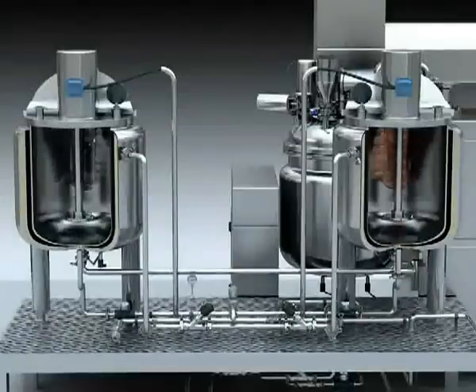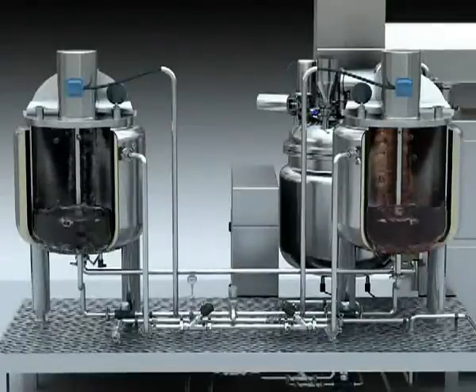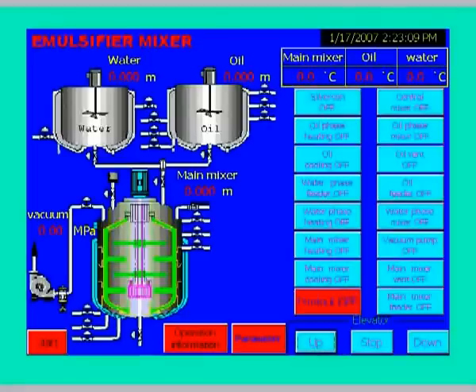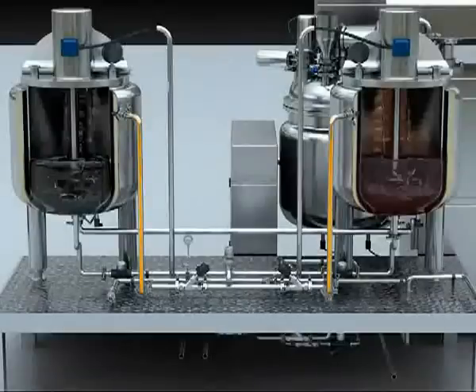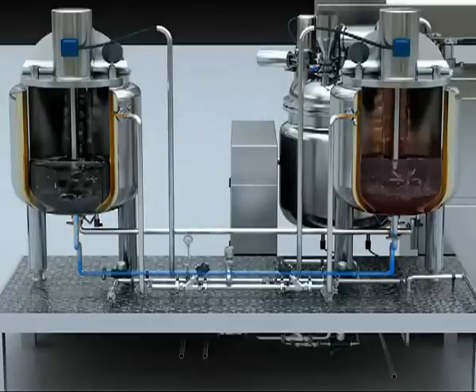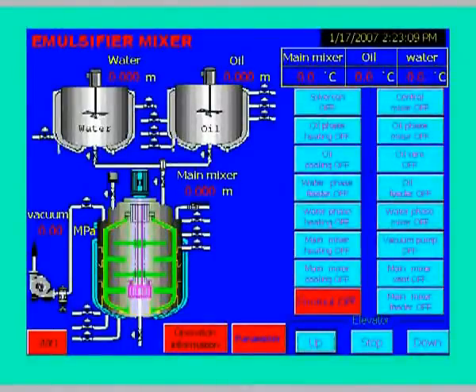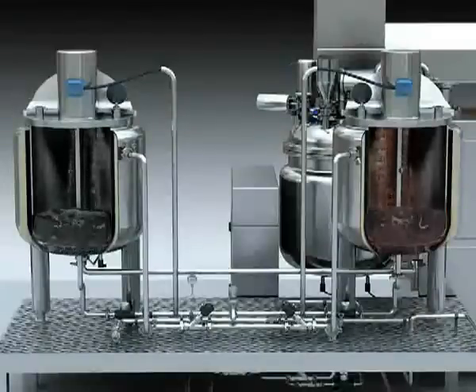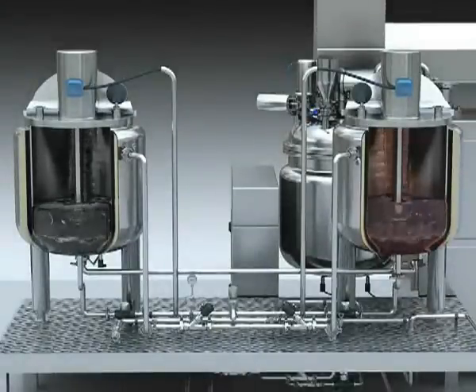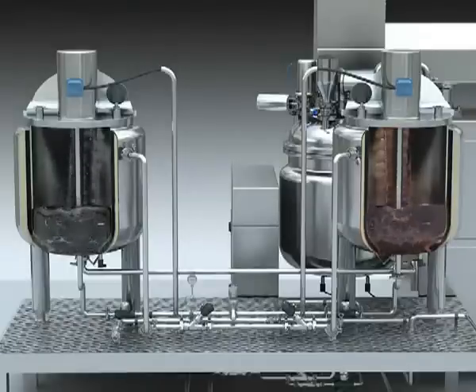2. Pre-treatment of material. Load the material to the oil tank or water tank manually according to the required batch process, and then touch the oil tank heat or water tank heat on the touch screen. The oil tank or water tank will begin to heat. Touch the oil tank mix or water tank mix on the touch screen and the oil tank or water tank will begin to mix and the material will dissolve. Turn off the oil tank or water tank heat and mix button after the pretreatment and continue to the next procedure.